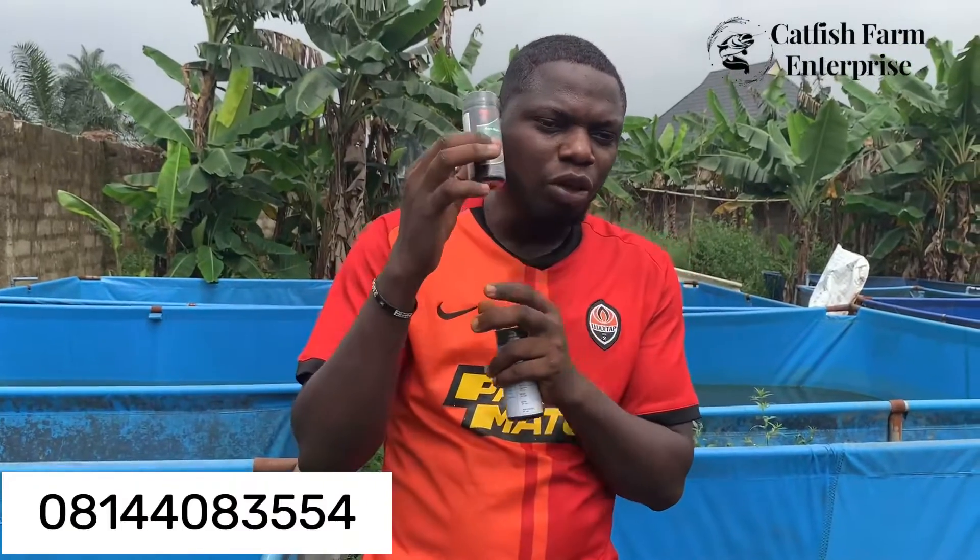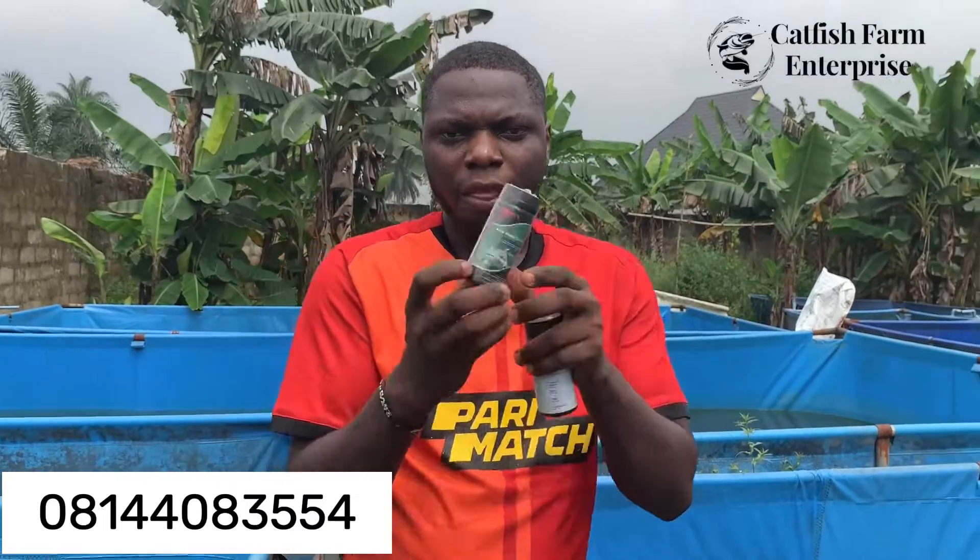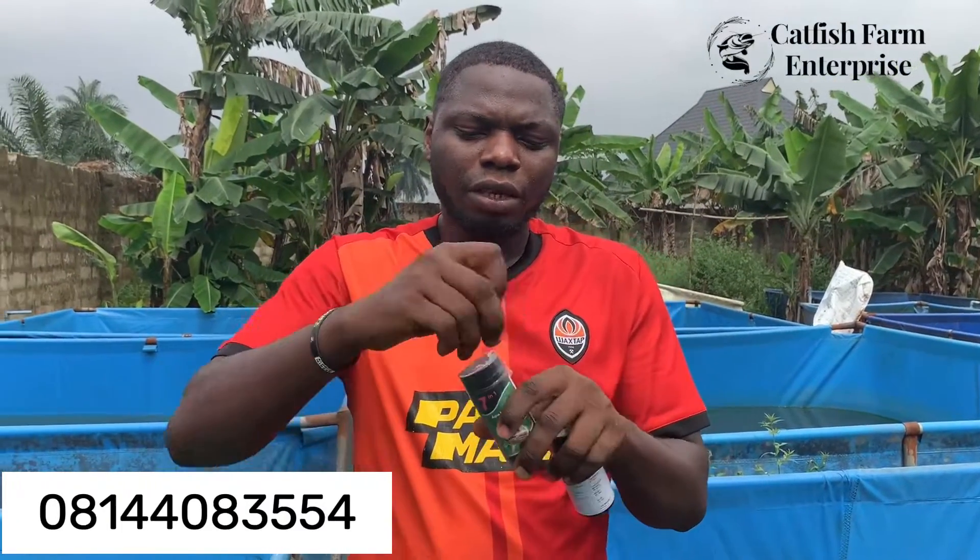With this simple 7-in-1 test kit it has 100 strips in it. With those 100 strips you could test your water across different points — you could test all your ponds before you exhaust the 100 strips. It's an easy-to-use kit.